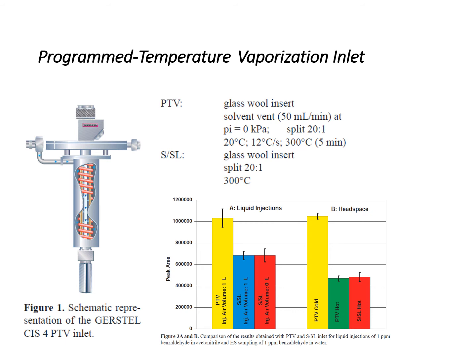Figure 1 shows the schematic representation of the PTV inlet, and the diagram also shows the difference between the liquid injection and the headspace.